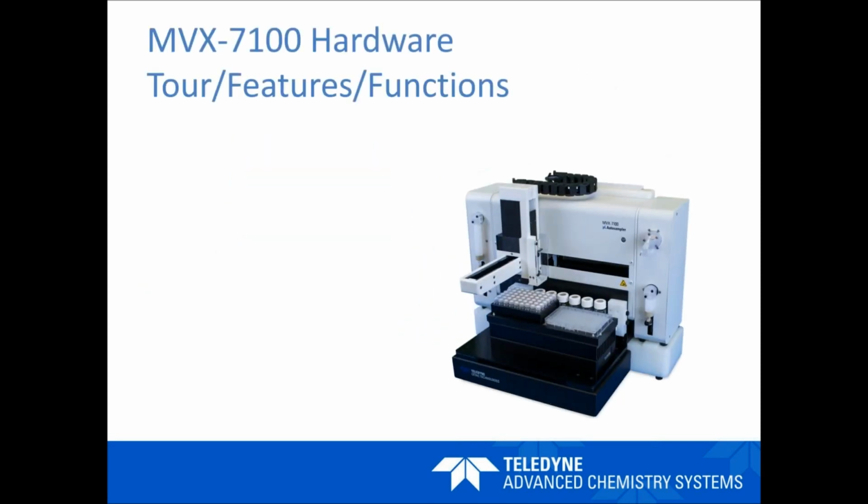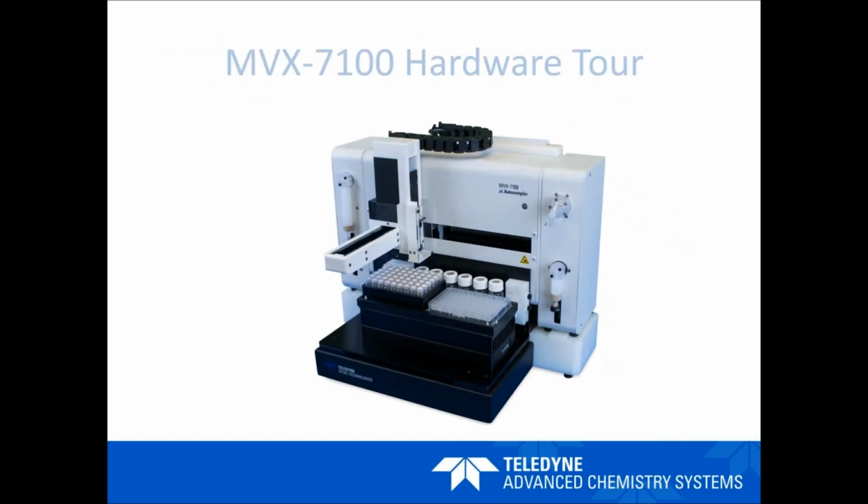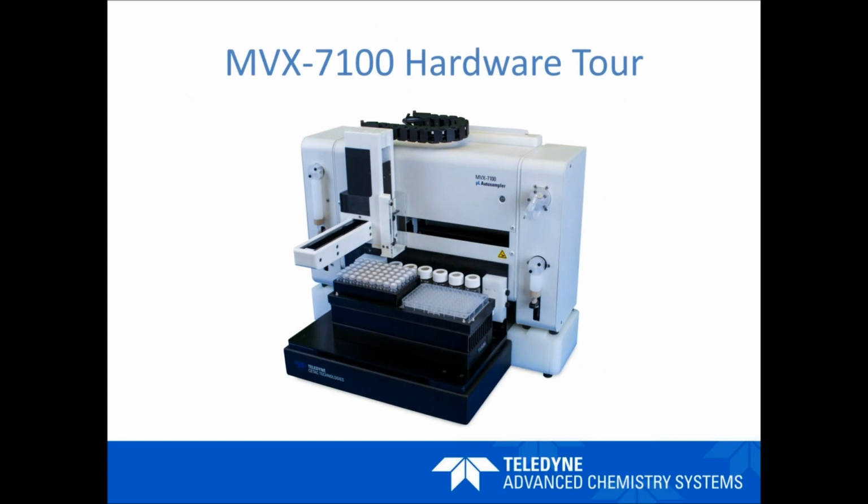So the next step here is I'm going to give you a quick hardware tour of the instrumentation, and then I'll go through some features and functions as well. So this is what we have, the MVX system. As an autosampler, it looks fairly complex, but I'm going to break this down and simplify it because it's a relatively straightforward piece of automation.